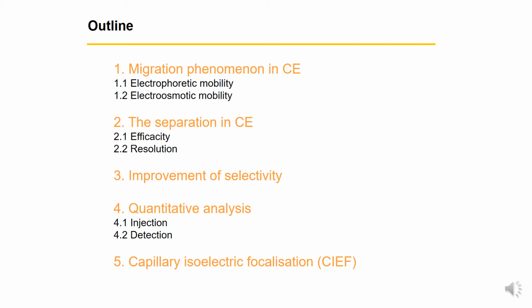So here is the outline of my lecture. We will speak about the migration phenomena in capillary electrophoresis, especially the electrophoretic mobility and the electroosmotic mobility. These phenomena can explain the movement of the molecules under an electrical field. So we will describe these phenomena in this lecture.